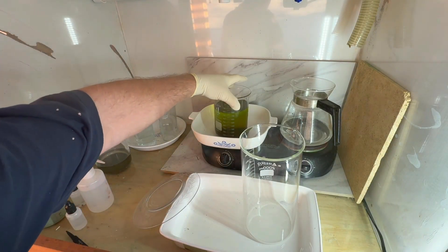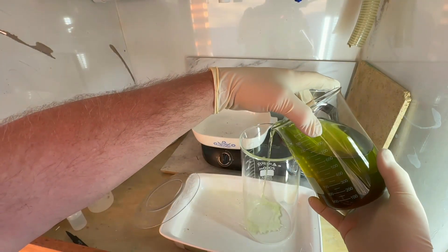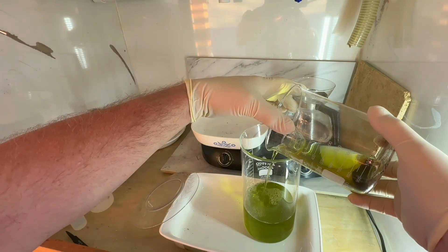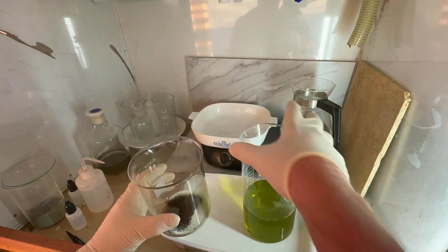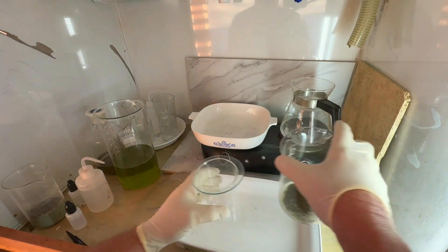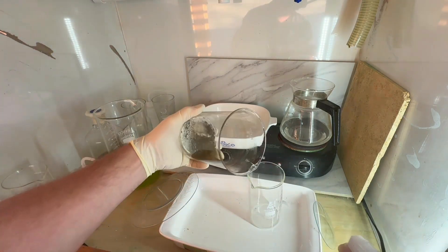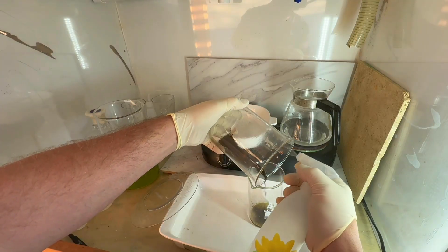It's the next morning — the gold settled overnight, you can see it nicely on the bottom and the solution on top is pretty clear. We're going to decant that off and then transfer everything to a smaller beaker, which is easier to work with for our washes. It looks like a reasonably decent amount of powder.